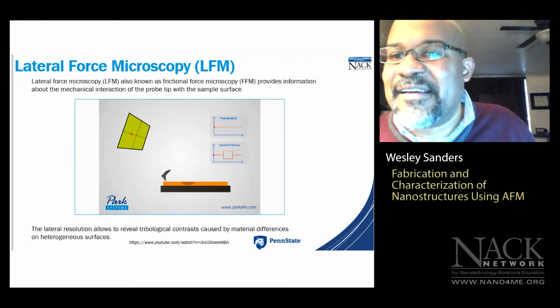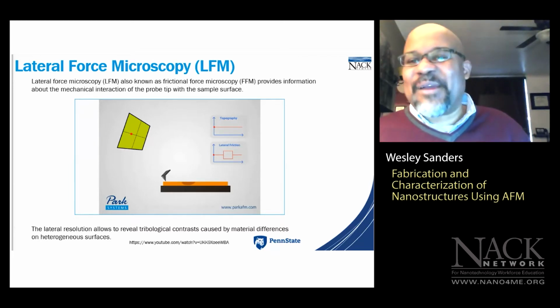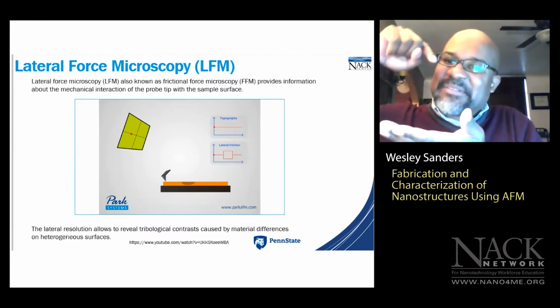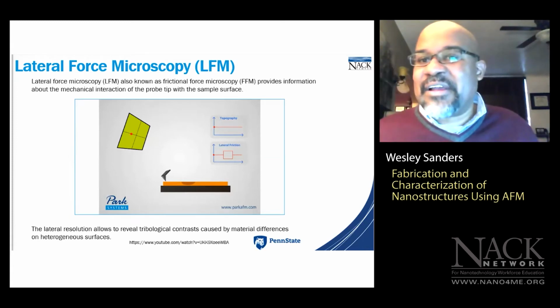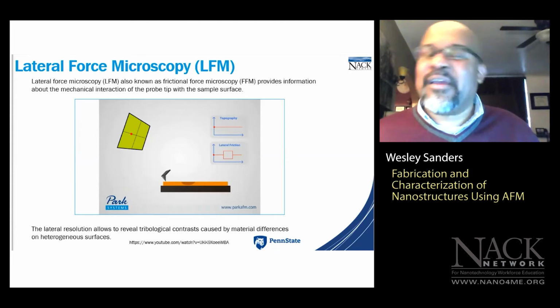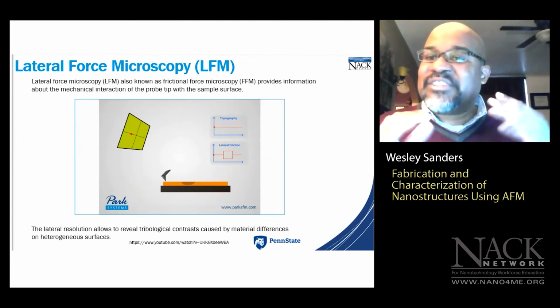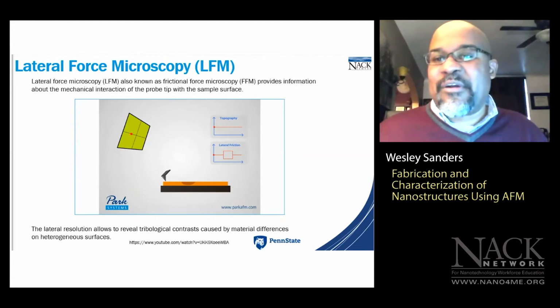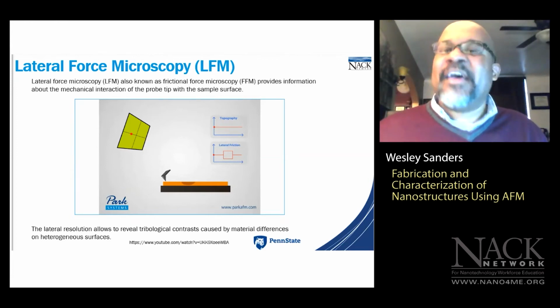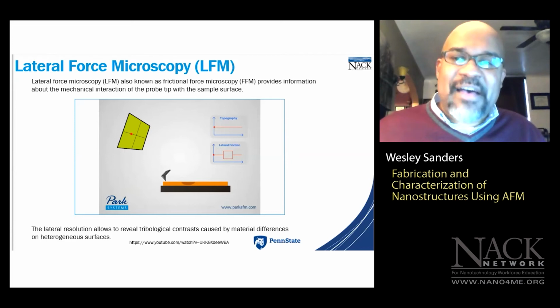No problem. So with lateral force microscopy, we need to have the AFM system operating in contact mode. That means the tip is making direct contact with the sample surface. When we image in contact mode, we rely solely on the cantilever's vertical deflection in order to record our surface topography. Okay, so that's one of the key advantages of contact mode.